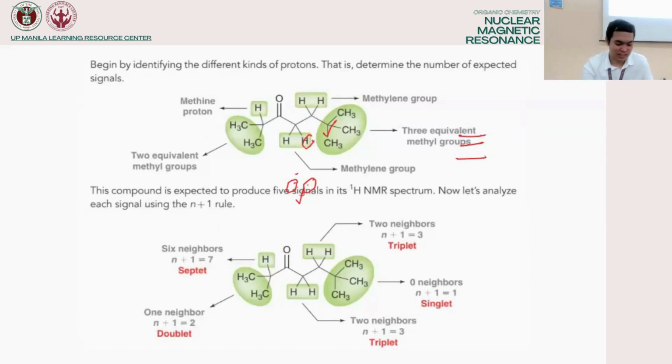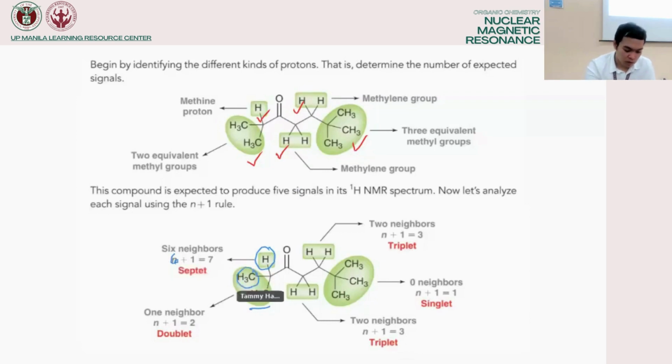Diba? Okay. So, answering everything, ito yung sagot. No? You have to group your protons, no? Kung pare-pare sila na nature. Afterwards, no, you get the neighbors. So, focus ka muna sa isa, you get the neighbors. You have 6 here. 6 plus 1. O ito naman, you have isa lang, no? One neighbor. Dito, how many neighbors? Carbon 1, carbon 2. Dalawa lang rin. Eh dito, bakit ito singlet lang? Sige, last.